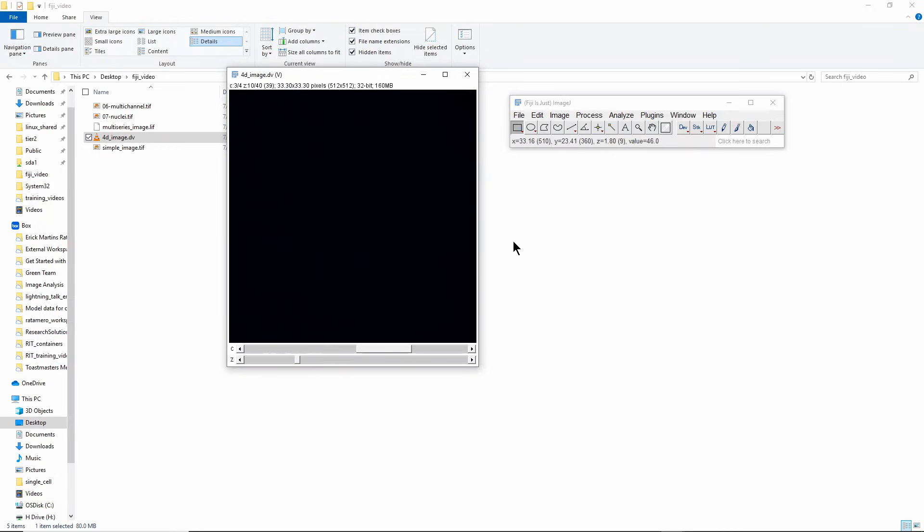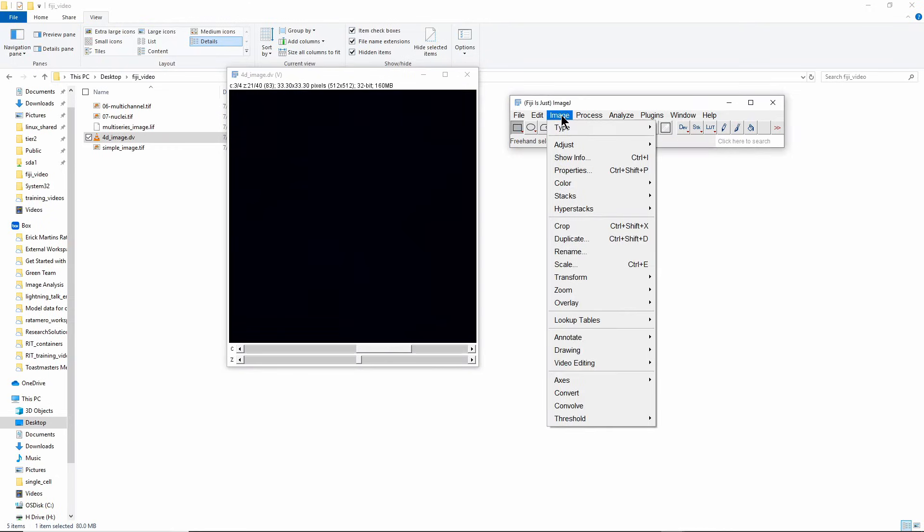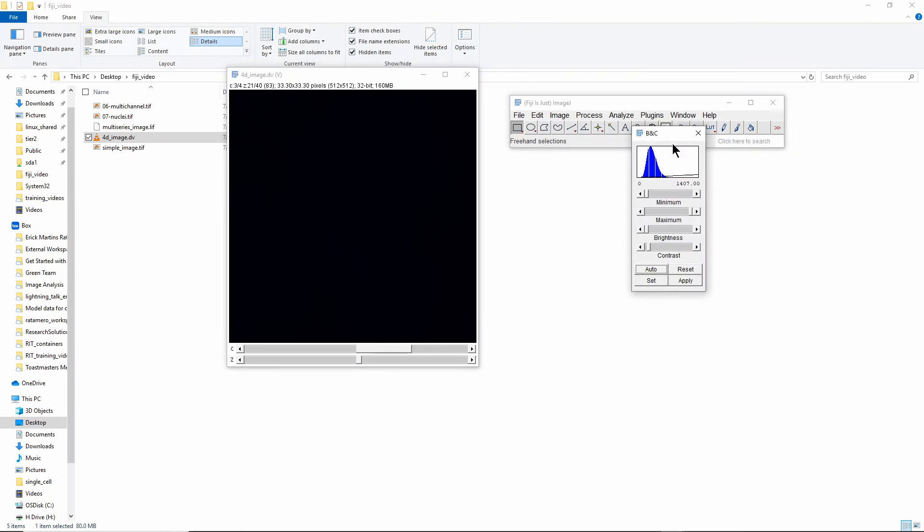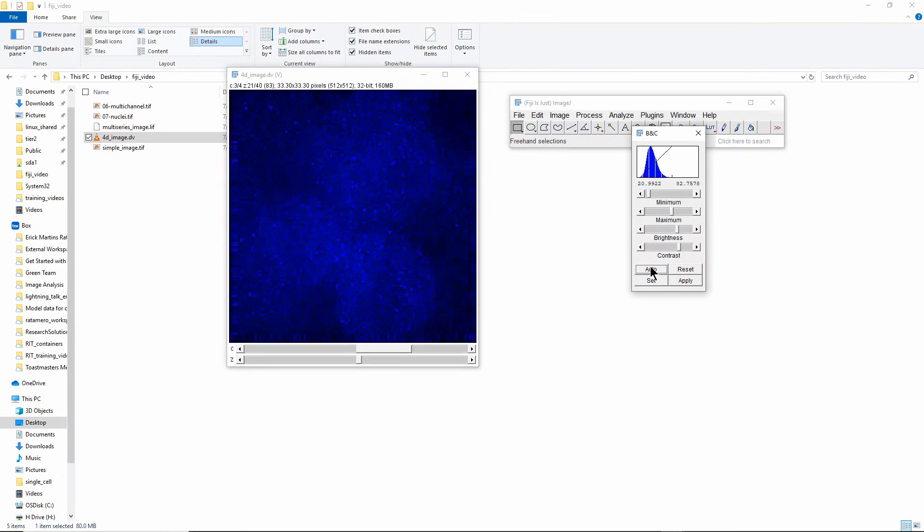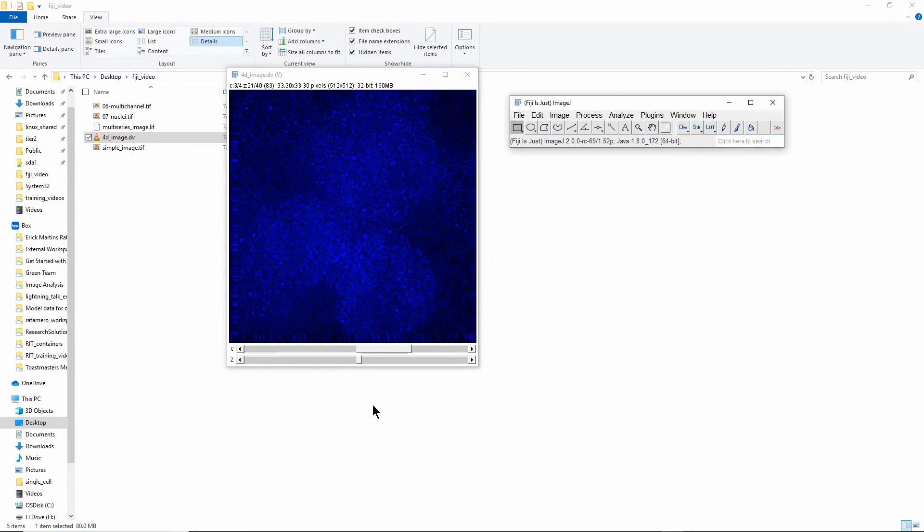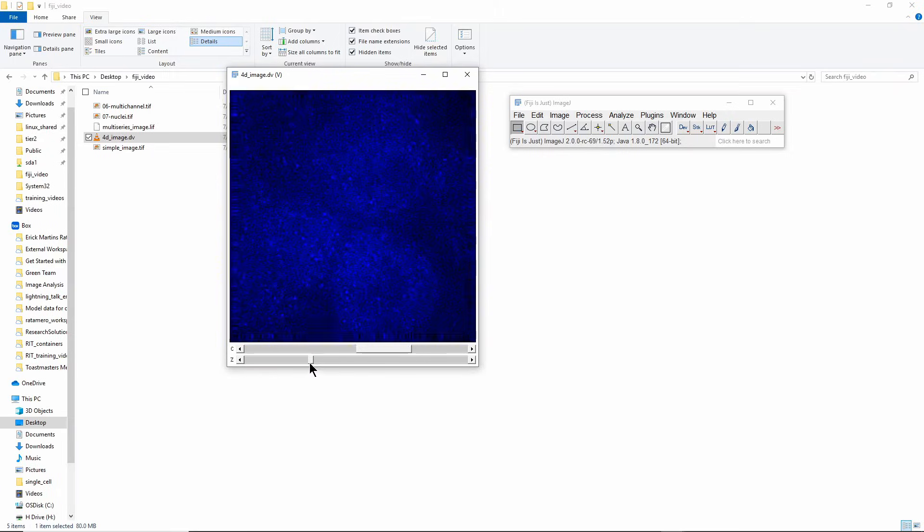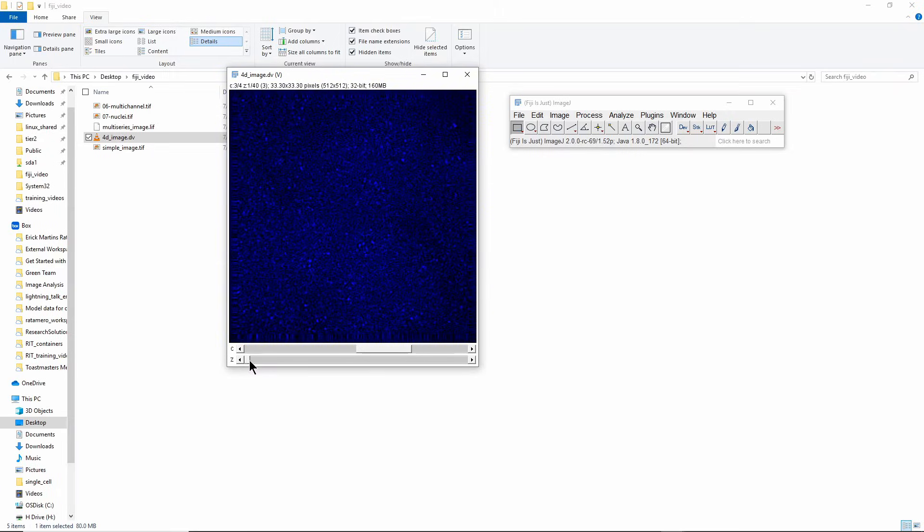I'll do the same thing for this channel. I'm going to go to Image > Adjust > Brightness and Contrast and press Auto, and all of a sudden you can see things that were there and you couldn't see before. Same thing as the green channel, you can see things.